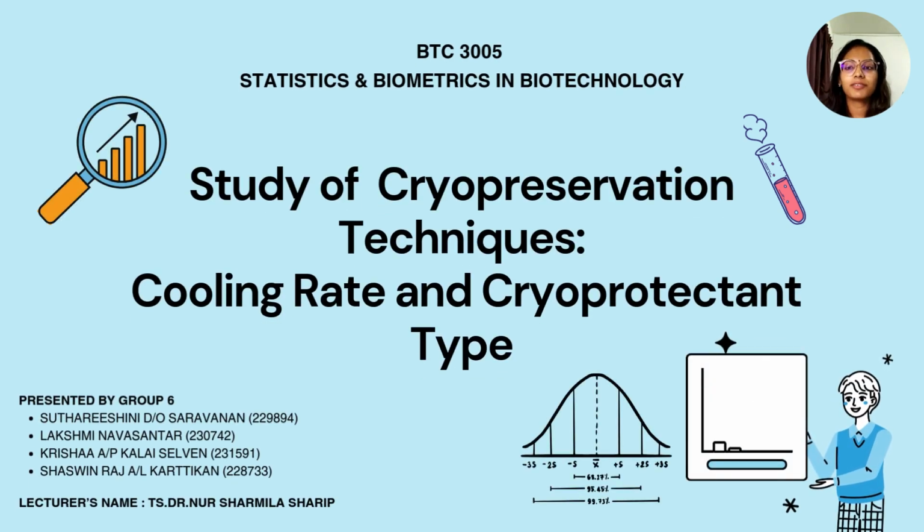Good day, everyone. We are from Group 6, and today we will be presenting our design of experiment project, which is a study of cryopreservation techniques, cooling rate, and cryoprotectant type. Our presentation will cover the experimental system, design of experiments, implementation using JASP, and quality control.